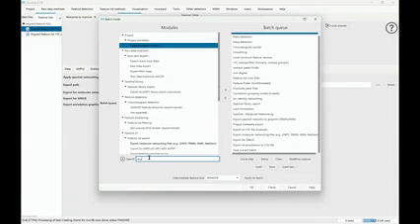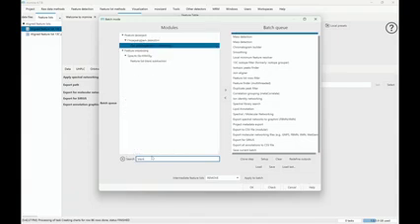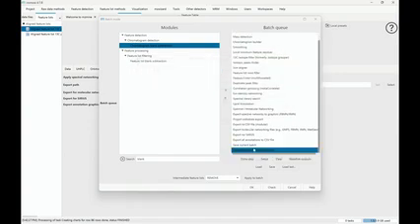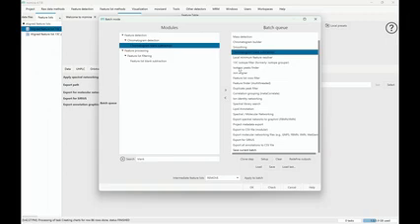If you want to have more export methods, or if you want to do, let's say, blank removal, you can type in the search bar here blank, and you're going to find there are different options for blank removal. And then you could just double click, it's going to open the setup, and it's going to add it here, and I can just drag and drop and put it at the right spot. Let's say after smoothing, I want to do blank removal, and then go on with the processing. Okay?